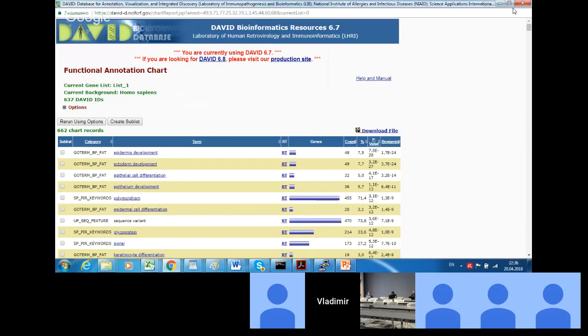That is why setting slightly different thresholds can give us slightly different gene lists and different results of gene enrichment analysis. The second type of analysis works not only with gene names or gene identifiers, but it takes additional information we have after differential expression analysis. I mean information related to, for example, fold change or other characteristics that represent the rate of differential expression.